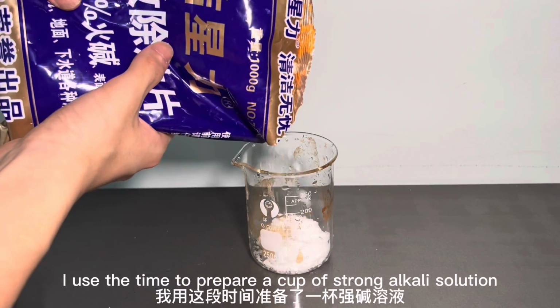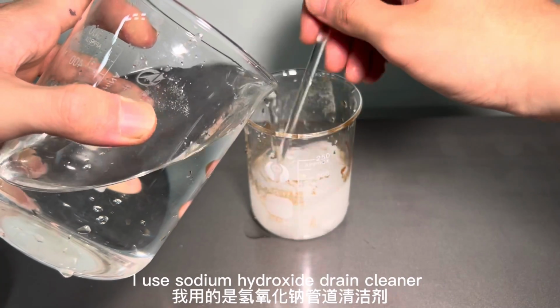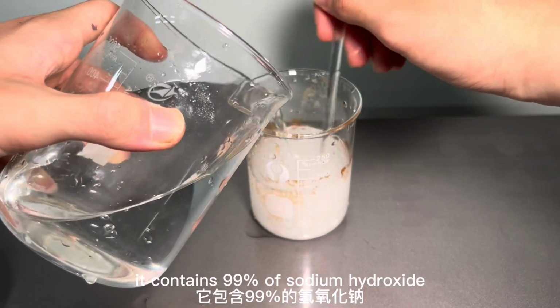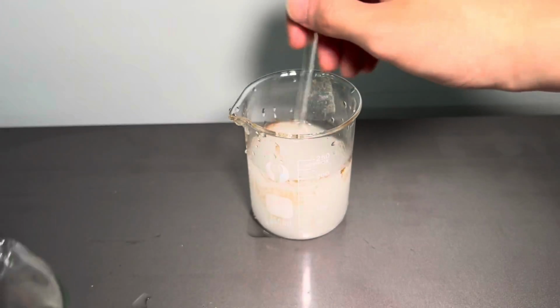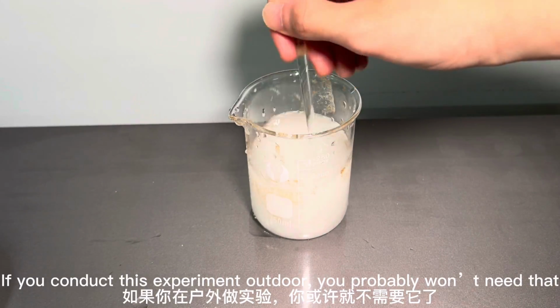I use the time to prepare a cup of strong alkali solution. I use sodium hydroxide drain cleaner. It contains 99% sodium hydroxide. If you conduct this experiment outdoors, you probably won't need that.